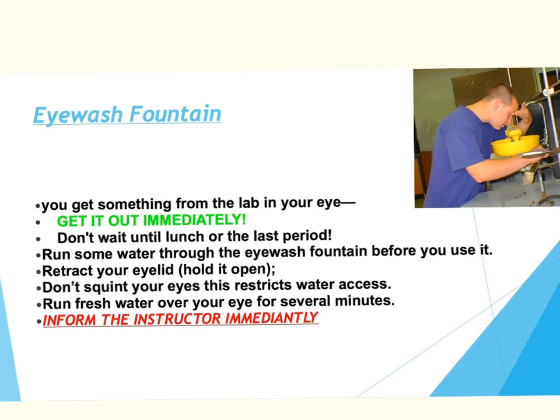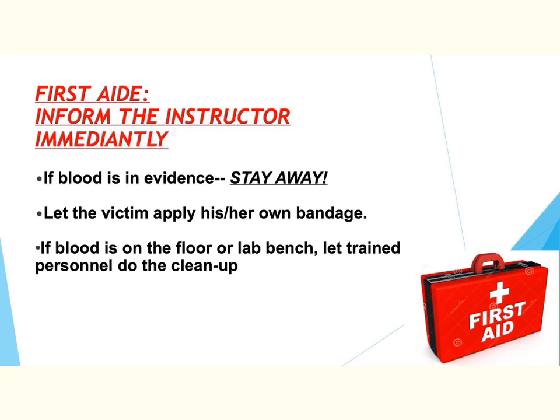My hopes are that we go over this material and that no incidents ever happen. But in that rare circumstance, we do want you to understand where the equipment is and how to use it. We do have a chemical first aid kit in our lab, available for student use as needed. If blood is ever evident, stay away. We will let the victim apply his or her own bandage if they are able to. If there is blood on the floor or the lab bench, you need to let trained personnel do the cleanup. I do have body fluid disposable kits in my lab that would neutralize and clean up these situations.